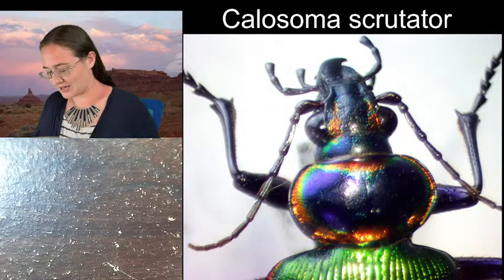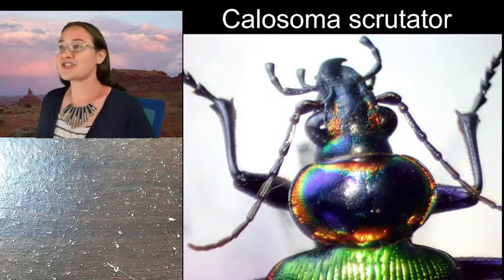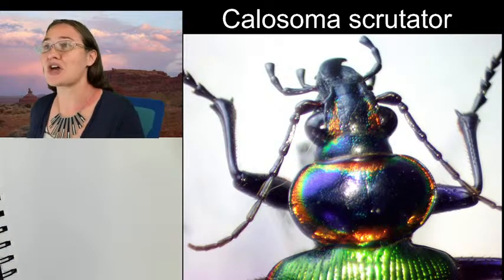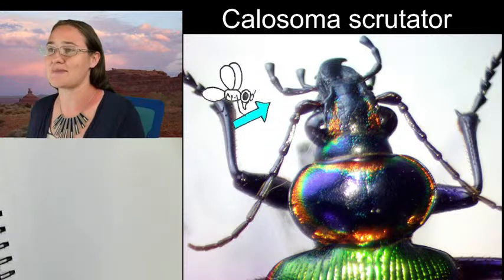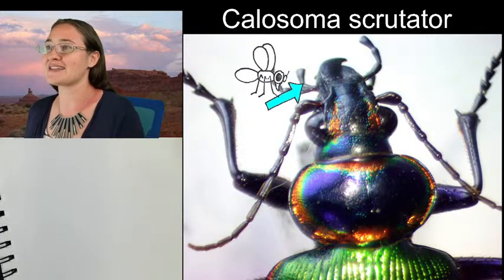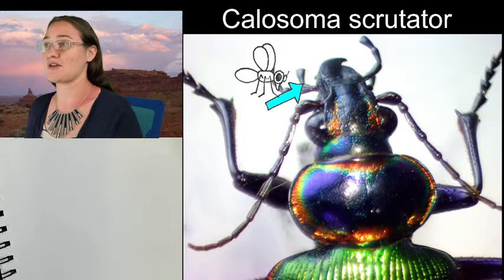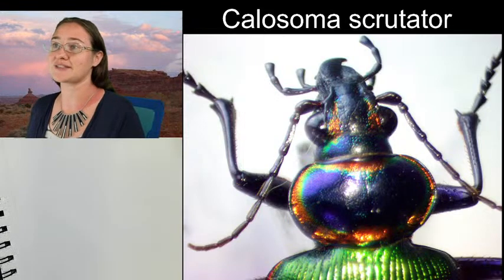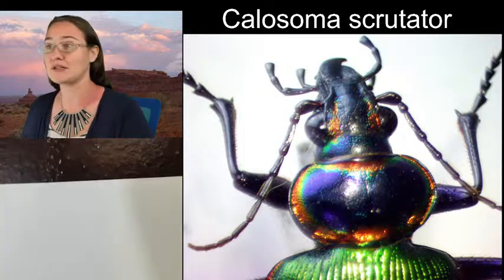So, when we are sketching our palps, I just wanted to share with you that the maxillary palps are going to be these larger ones on the outside. So this is actually connected to the maxillary. And then this one, the smaller one that's inside, this is the labial palp connected to the bottom jaw. All right. So these are both palps, but they are connected to different pieces of the mouth, and so they actually have different names.